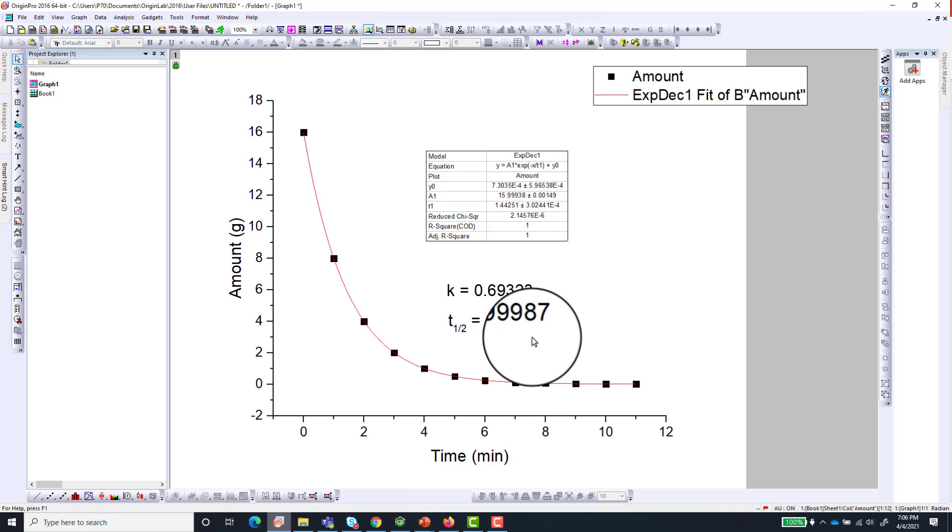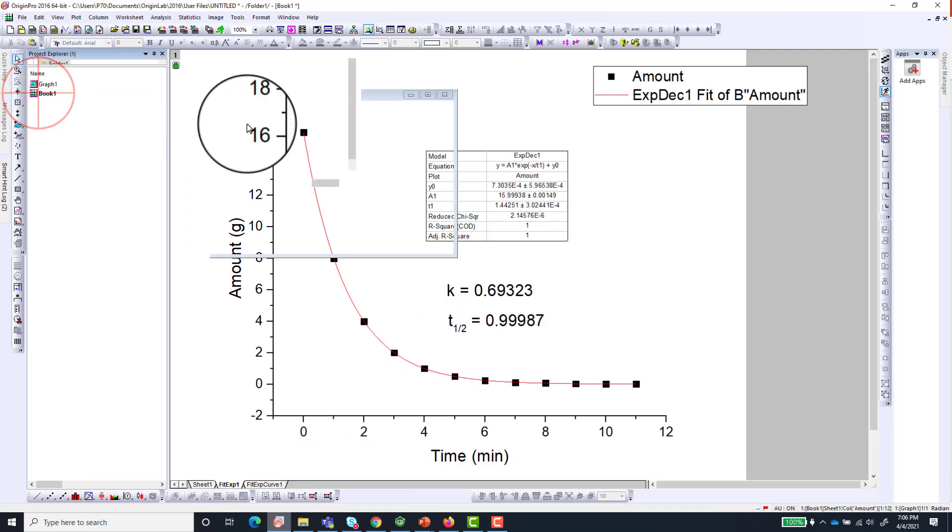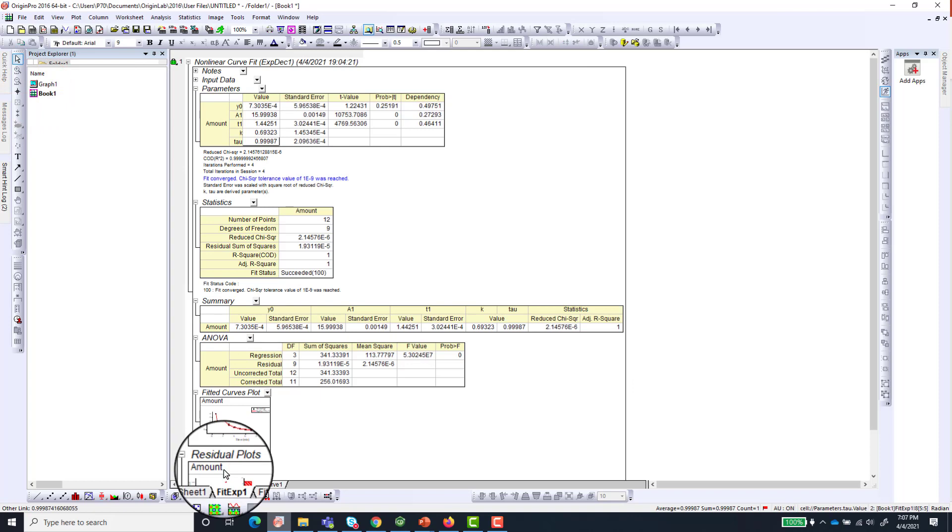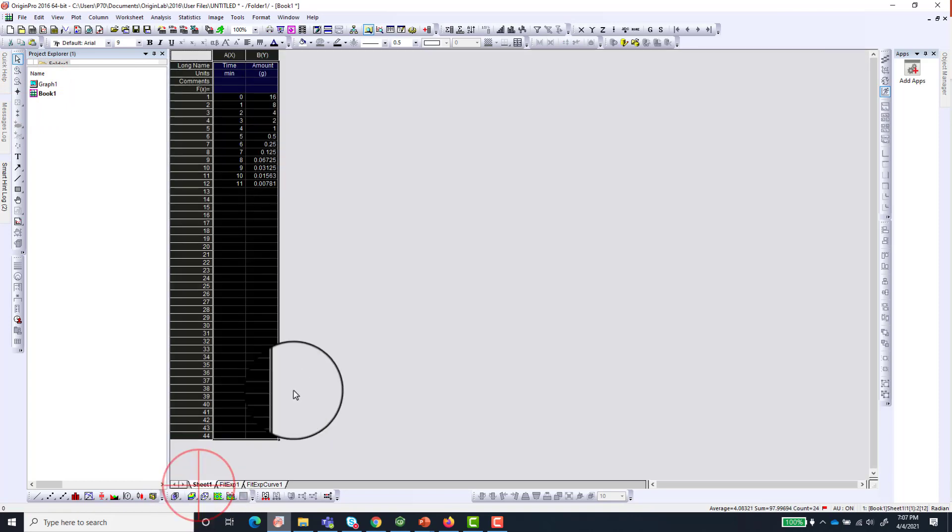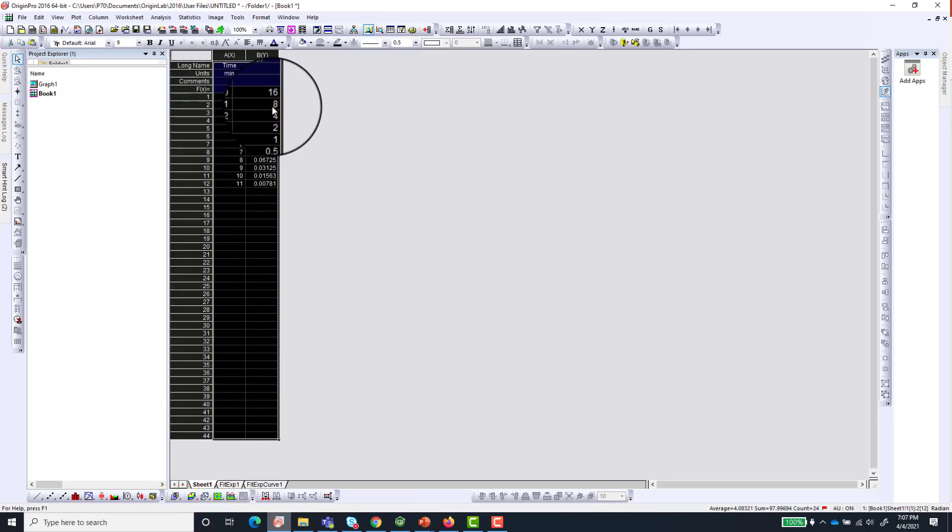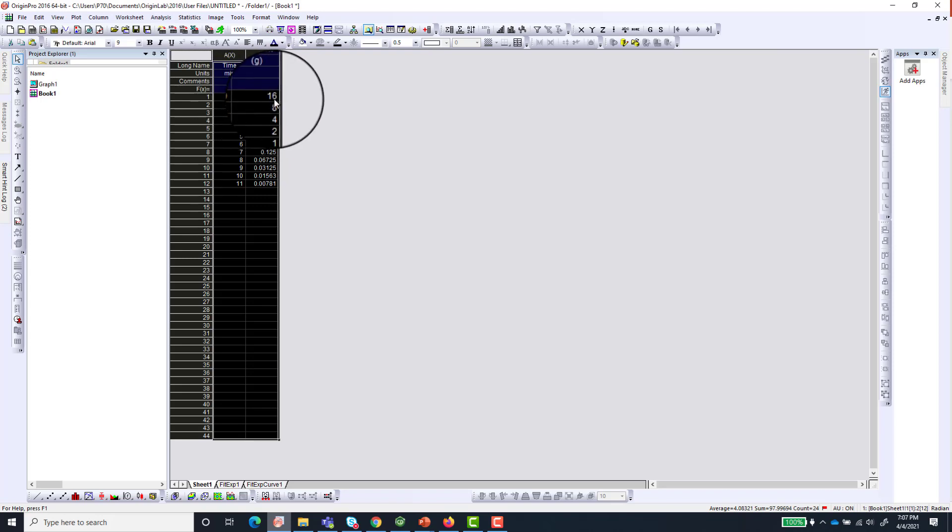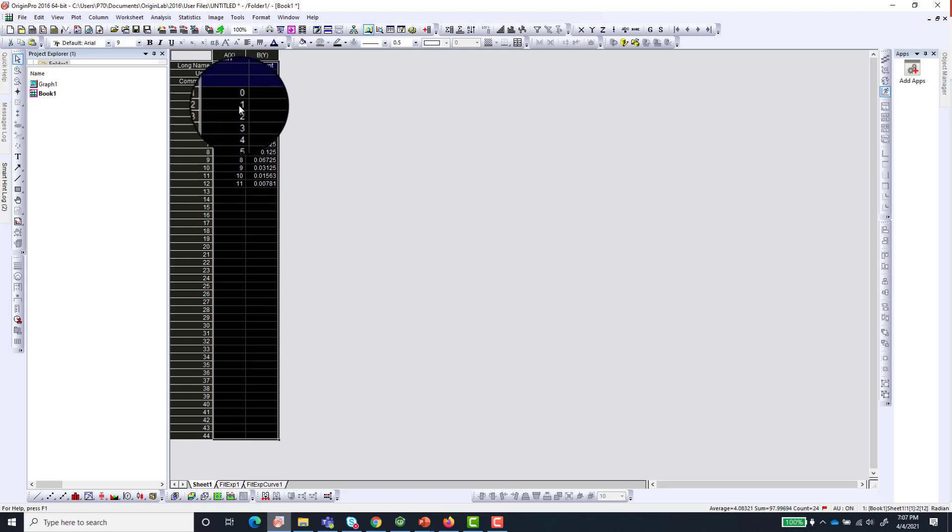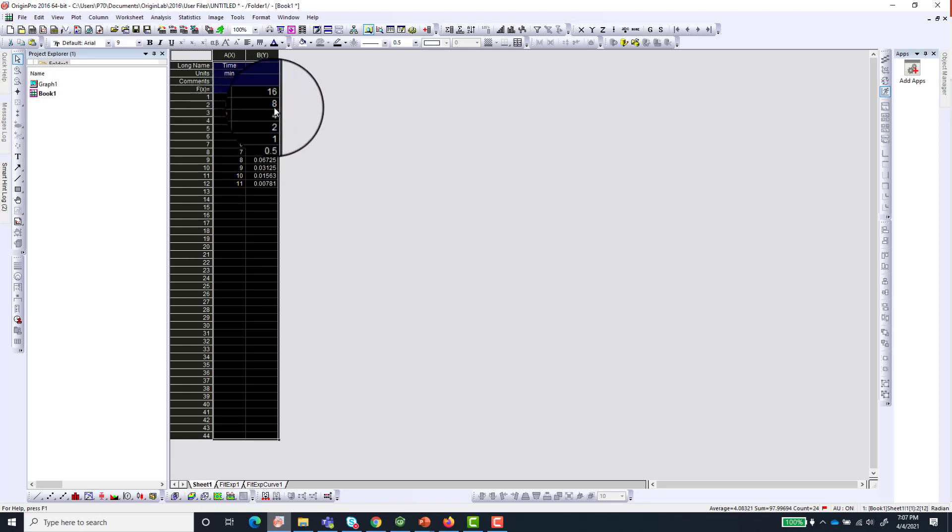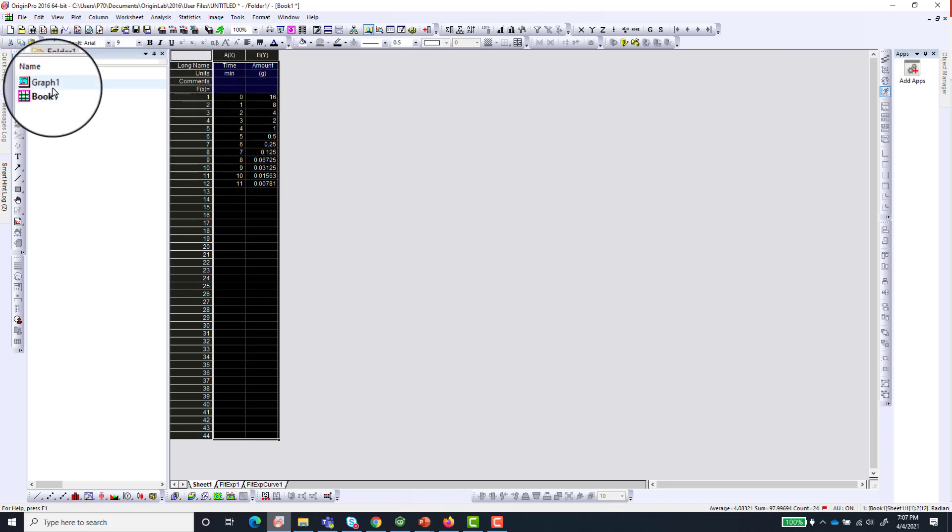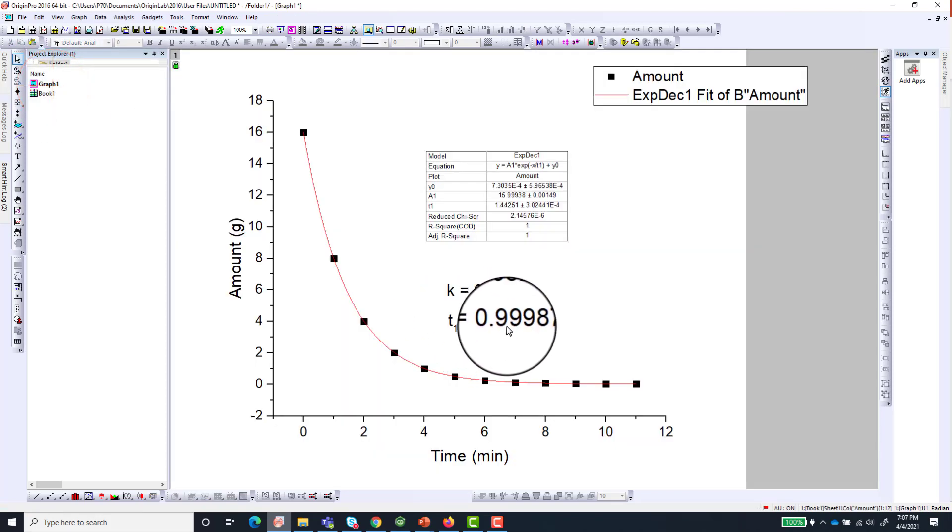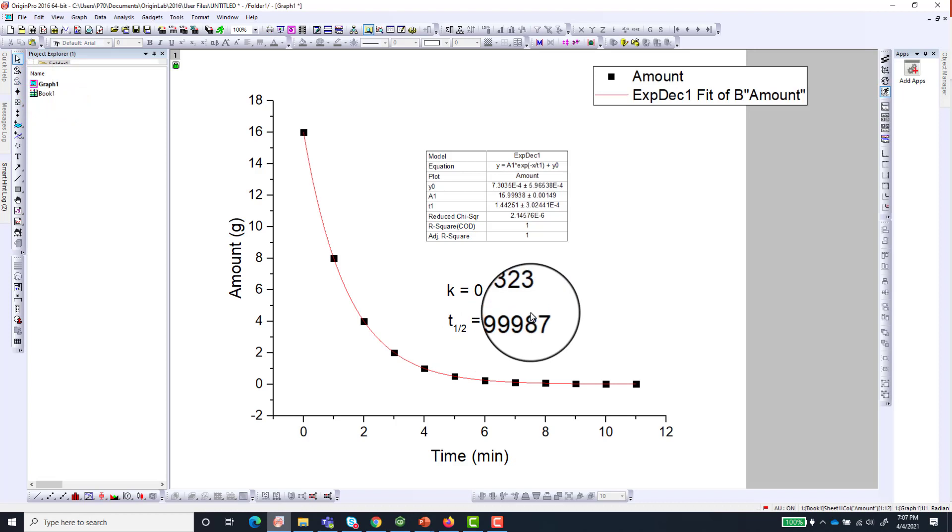This makes sense because when you look at the data itself you can see the progression. Every 1 minute the amount of the material will be halved. So it started with 16 at 0 time, and after 1 minute it went to 8. After another 1 minute it went to 4. And that is why you can see that the half-life is very close to 1 in this case.